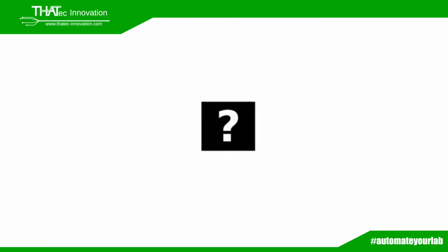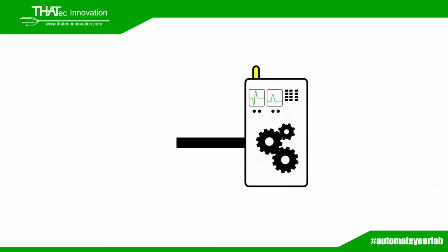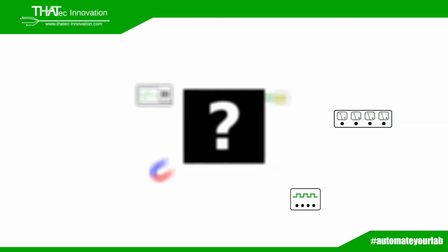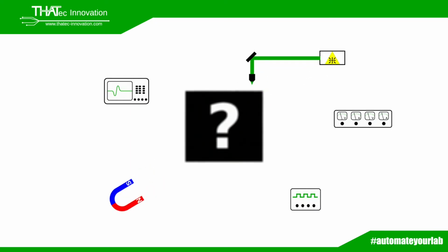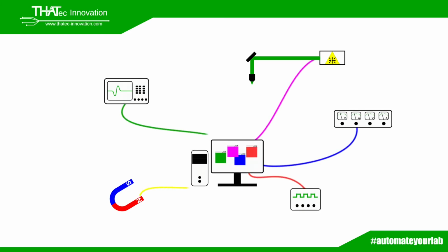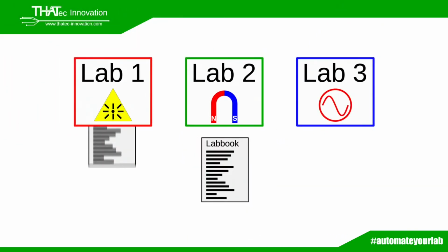Working in research is all about stepping into unknown territory and investigating new phenomena. Often, this means that there is no commercially available system to perform the required investigations. Instead, different devices have to be combined for the experimental measurement setup, each performing different tasks at a given time. Even though the devices might allow for remote control, combining the devices to follow a specific measurement routine requires a lot of programming and can be a time-consuming task, especially since documentation of the measurements as well as unified file formats between setups need to be considered.